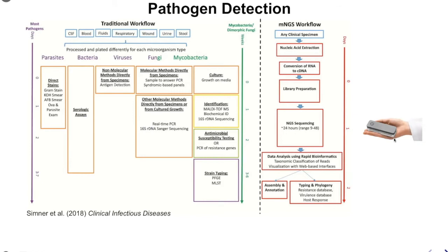Here on the right side, what you can see is actually an Oxford Nanopore sequencer. Using this Oxford Nanopore sequencer, the time of the sequencing can probably be reduced rapidly, so we probably can have a diagnosis within hours using nanopore. So I assume that the future will be somewhere where we are combining still old tests, but we will transition slowly to NGS tests, because they just have better turnaround times. And also, one other thing is NGS does not need to distinguish between these different types of parasites you're looking at. It's just one test to rule them all in general.